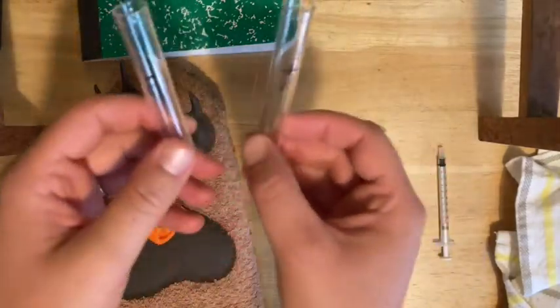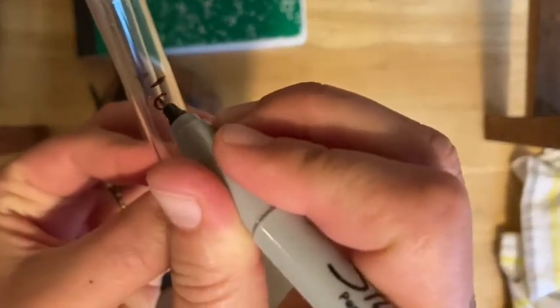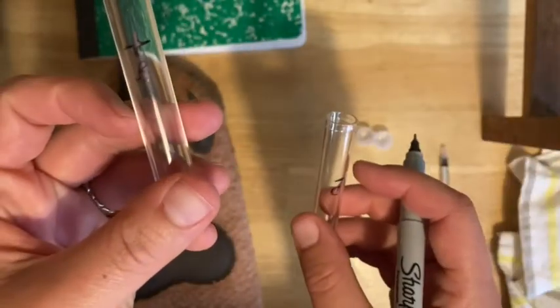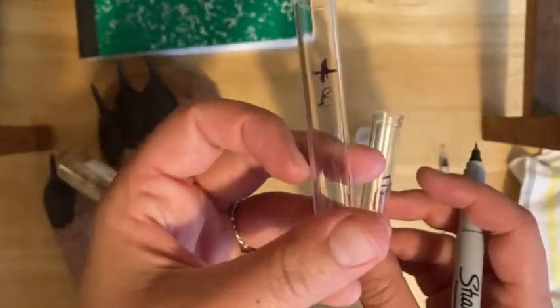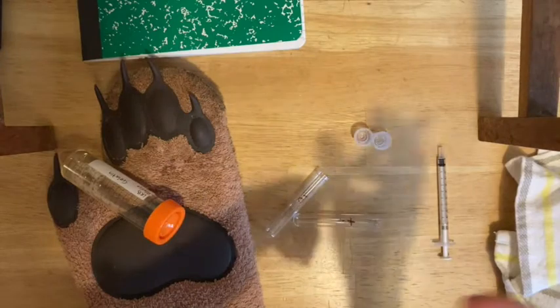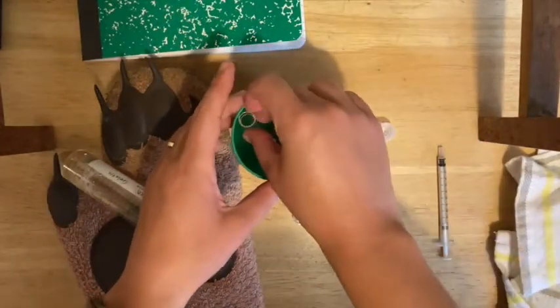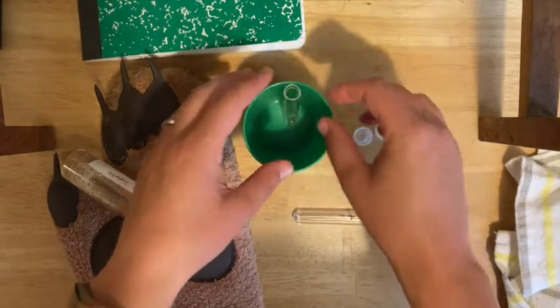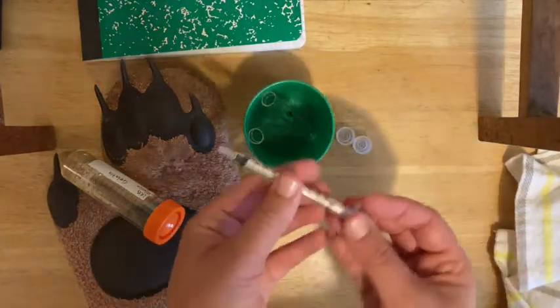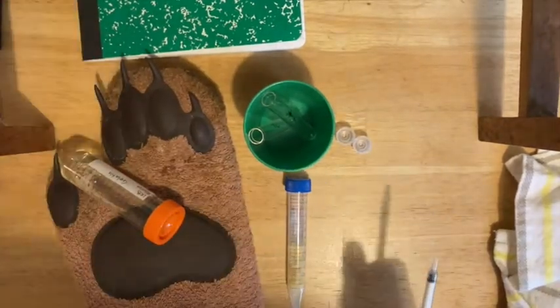Make sure your two small test tubes are labeled. One should be labeled minus C — that's your control, and it's going to get just water and gelatin, no pineapple juice. The other should be labeled plus B — that one's going to get gelatin and the pineapple juice that should have the bromelain enzyme in it. Get some sort of cup that these two tubes can stand upright in. You'll also want your one mil pipette, your pineapple solution, and some tap water.